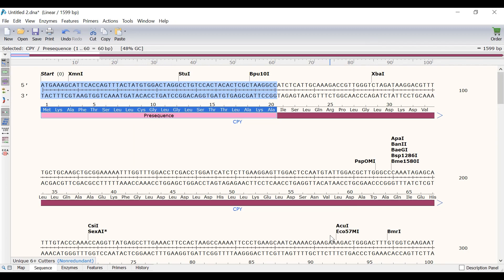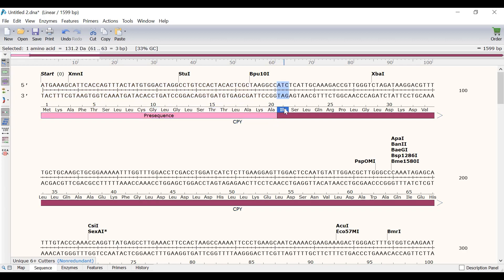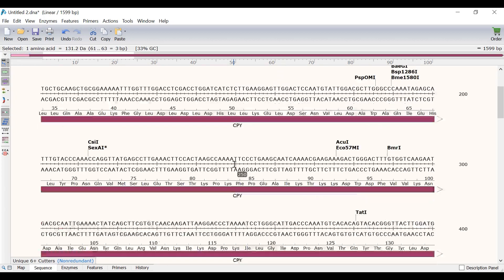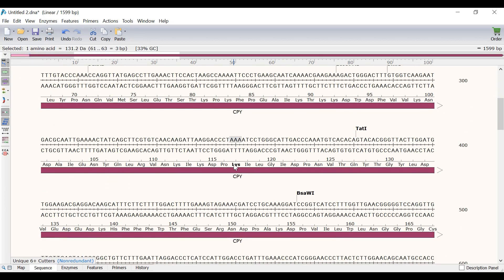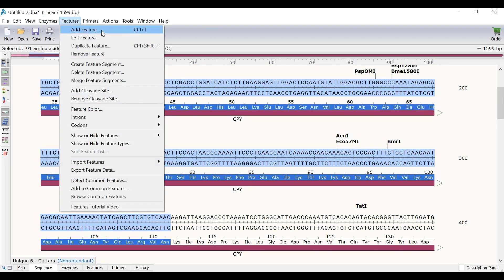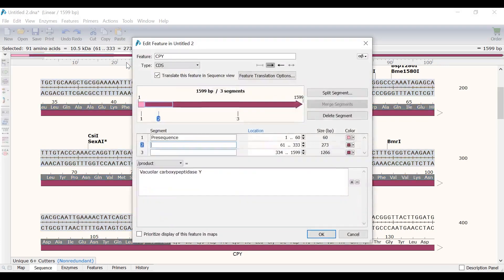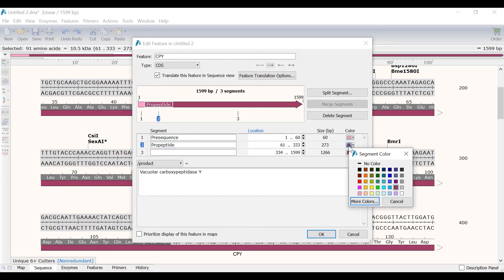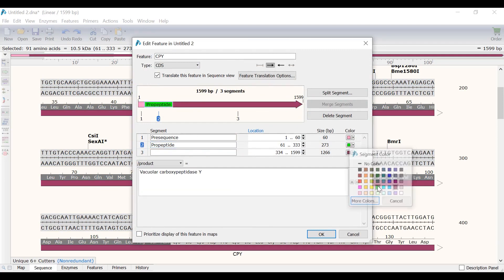The CPY gene also has a pro-peptide that ends at amino acid 111. So, I will create another segment for this. I will click on amino acid 21, scroll down, and shift click on amino acid 111. Again, I will go to Features, Create Feature Segment. This time, I will call the segment pro-peptide and colour this segment green. Then I will click OK.